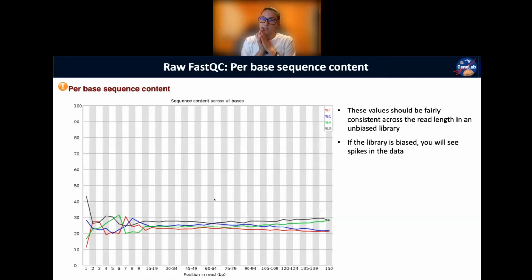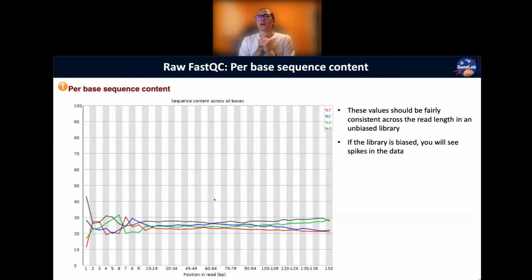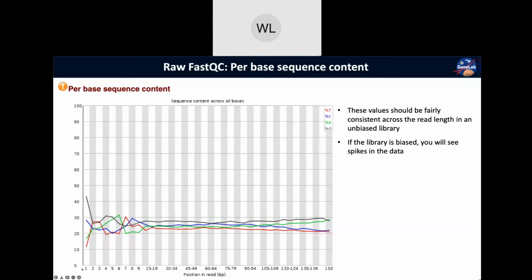Low sample size. What do you mean by low sample size? We're looking at reads from one sample. Oh, I mean a low number of nucleotides, because they are only on the first one. Low number of nucleotides, so, well, low diversity. Is that what you're referring to? So low diversity is what we have here. I don't know if I read this chart correctly. I thought the first one is position, right? Yes, you're in the first position.